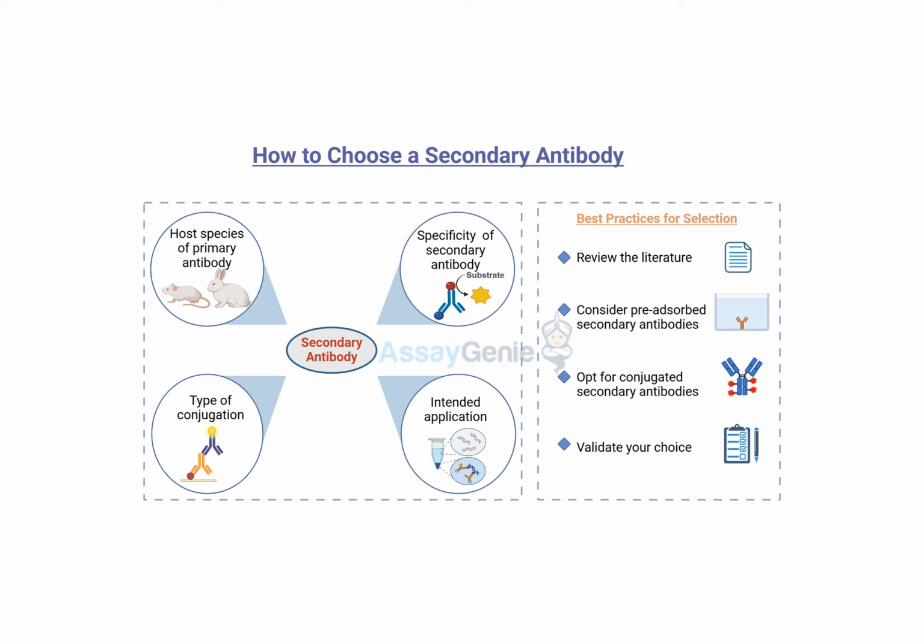And your source goes into all these fascinating details, like matching the antibody to the species it came from, or the different ways to actually make them visible. Some of them even glow. It's wild. It's pretty cool. And it really emphasizes how the choices you make there can seriously impact your research findings. Oh, yeah, absolutely. I mean, choosing the right secondary antibody can make or break your experiment.